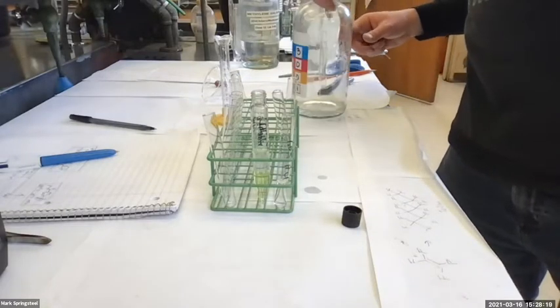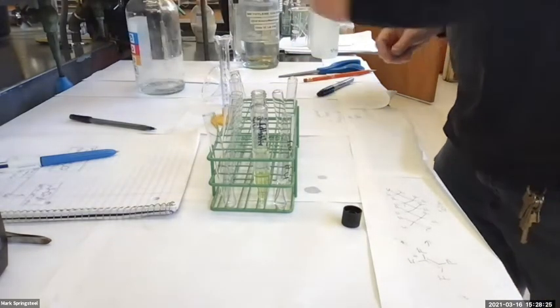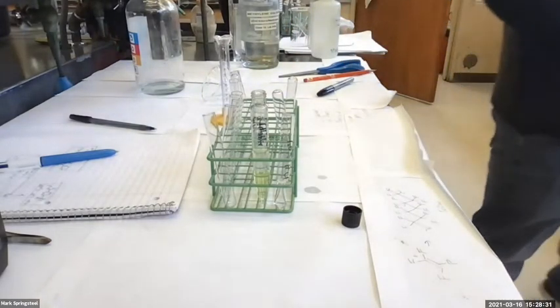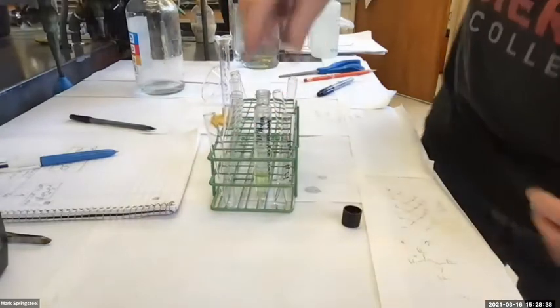Is it because it's the organic layer, it's nonpolar, meaning that there are no dips or anything like the top layer? It's easier to take out. It's more about the shape of the flask. You'll see it gets narrower at the bottom. It's easier to separate that way.